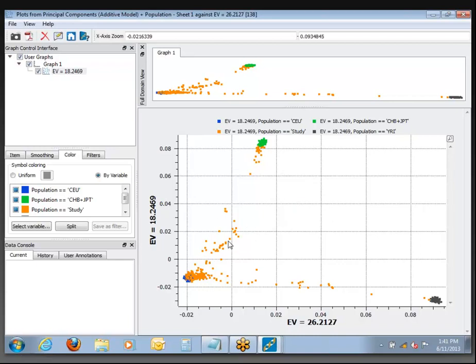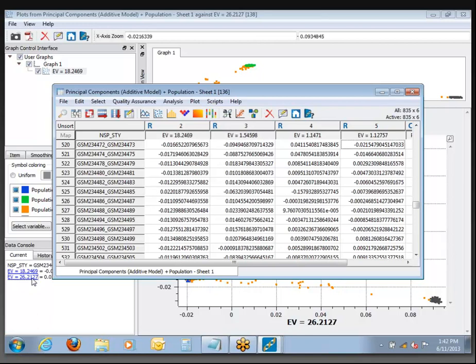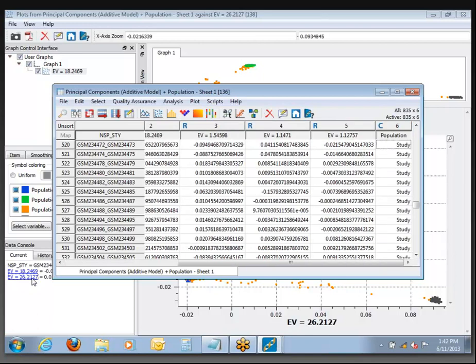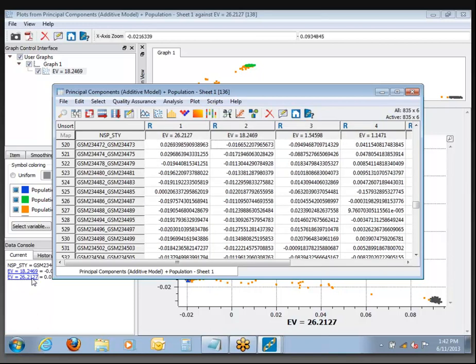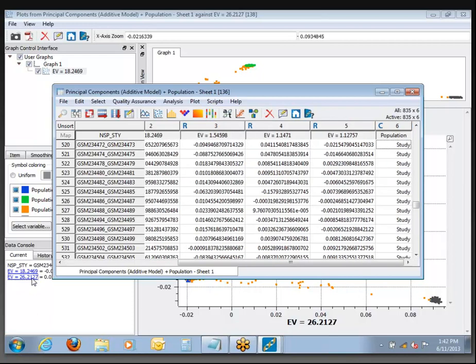That's probably what we're getting here — although if we looked at additional components or had the HapMap Phase 3 data with more reference populations, we could be more certain. When you click on points in the scatter plot, it will always give you the subject ID for the particular sample you're looking at. You also have links that will take you back to the source data and highlight the exact cell — so if you saw an outlier sample and wanted to check out whatever else you knew about it, you could just click that link and find out more.